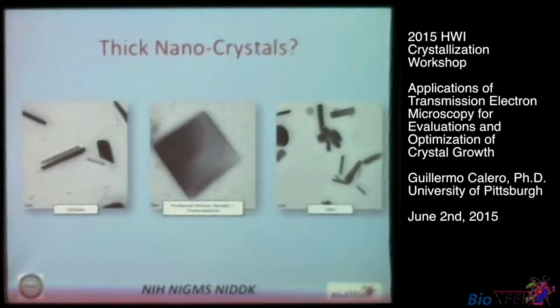We tried to use the 4 millimeter Teflon ball from Hampton Research, and we were not able to break anything, of course, because they were quite small. My lab is a yeast lab, and we break yeast using glass beads of much smaller diameters, 1 millimeter or 0.5 millimeter. So we decided to use those to see if we could break them.